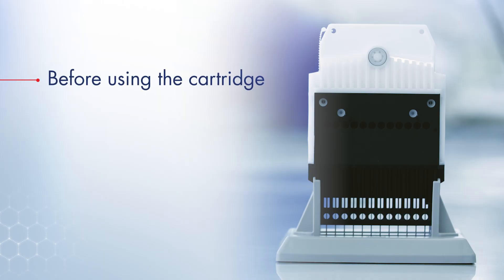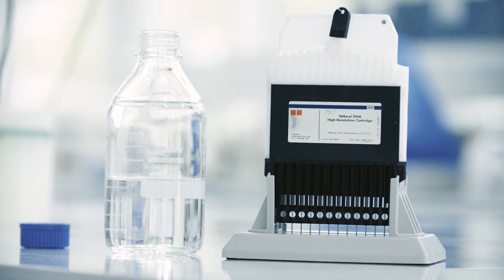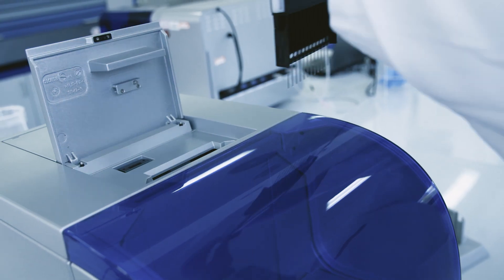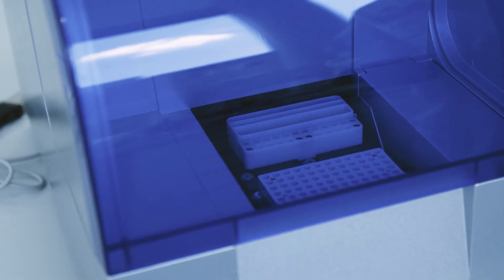Before using the cartridge, it is crucial to equilibrate it for at least 20 minutes to room temperature to ensure proper analyte separation. To equilibrate the cartridge, either place it in the cartridge stand with wash buffer overlaid with mineral oil, or directly place the cartridge into the QIAxcel Advanced. Ensure the buffer tray is loaded and wait.